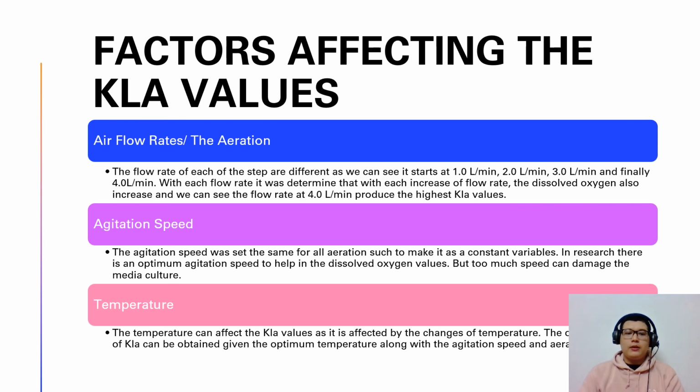Now, the optimum values of KLA can be obtained if there is the optimum temperature along with the optimum agitation speed and also the optimum airflow rate.